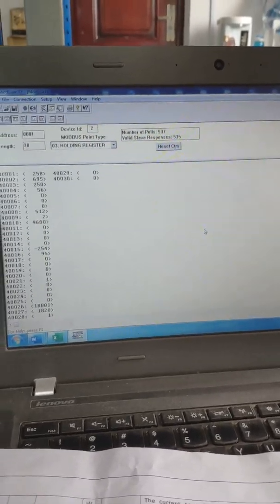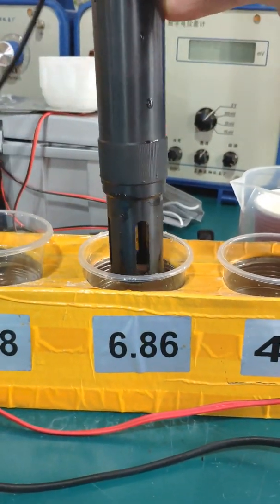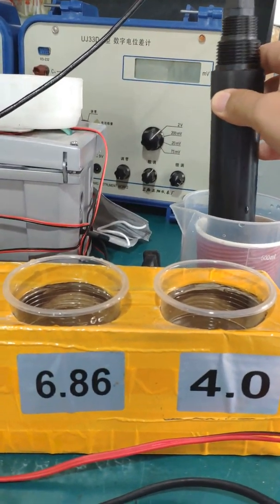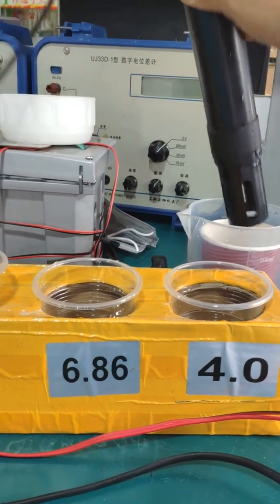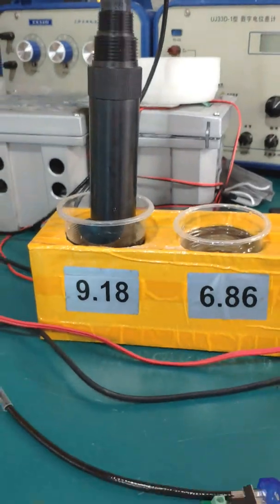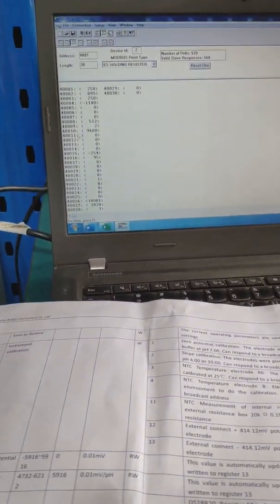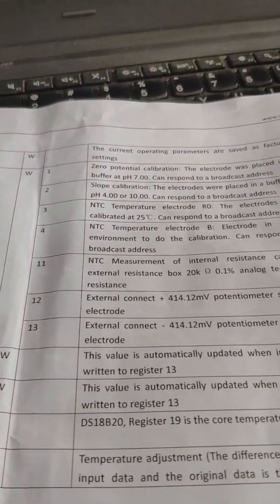After the value is stable, check the reading. Then put the sensor in pure water to clean it, and then start the second point calibration. Wait about one minute again before starting the second point.